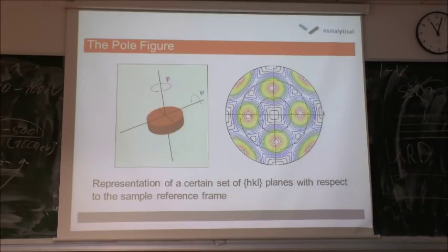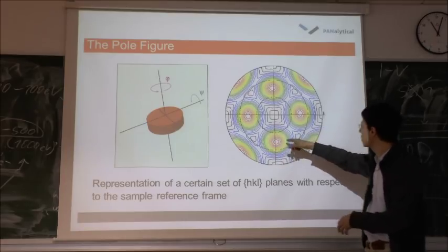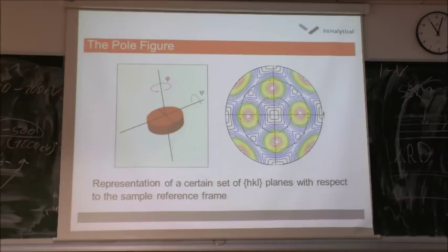That means the ceramic that we have has grains that are not perfectly aligned, but have some orientation. If it were randomly oriented, you would see the same intensity all around for 360 degrees.